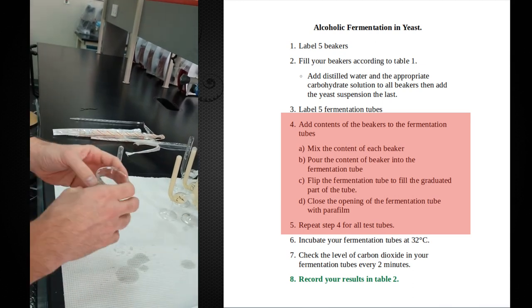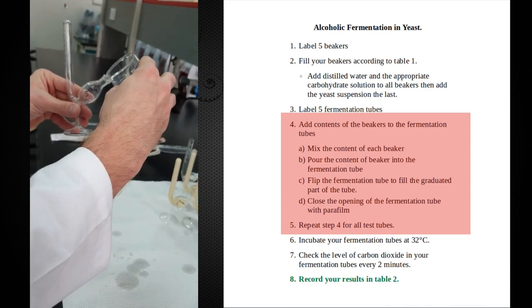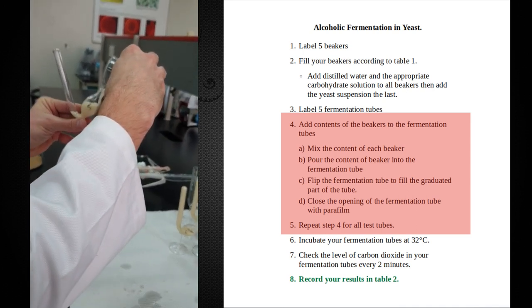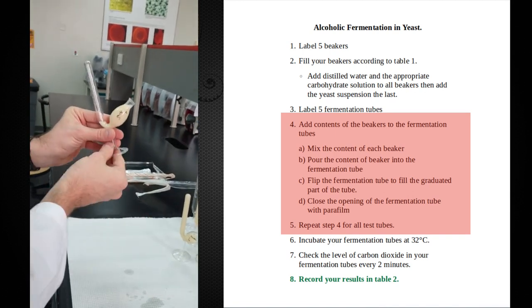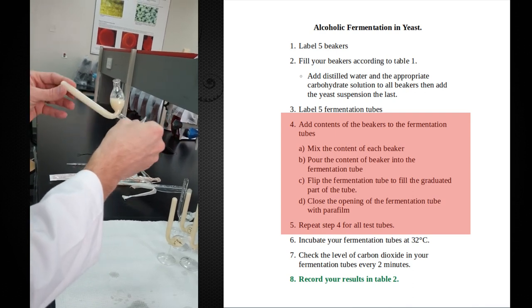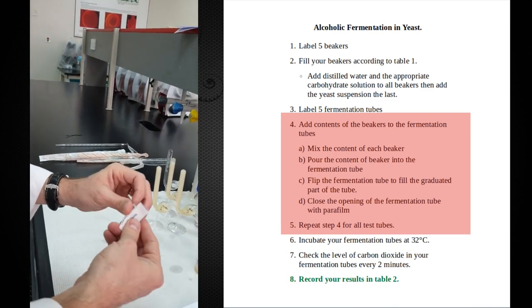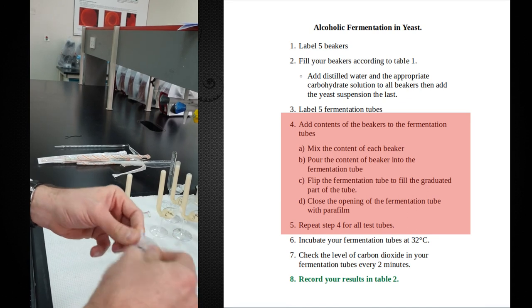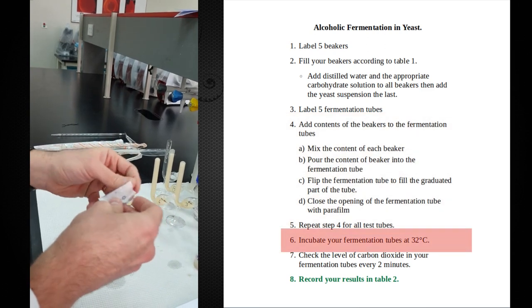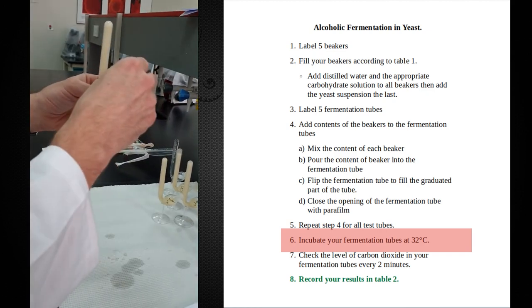And then number five. That's our starch and yeast. Mix it well, and try to treat all your samples the same way. That's how you're supposed to be doing your experiments. Do all your samples exactly the same way as much as possible, so the only difference between them is your independent variable, which in this case is your carbon source. Just need to seal it off, and then we're going to put this into the water bath and look at the results at the end. We're going to look at how the amount of gas builds up over time.